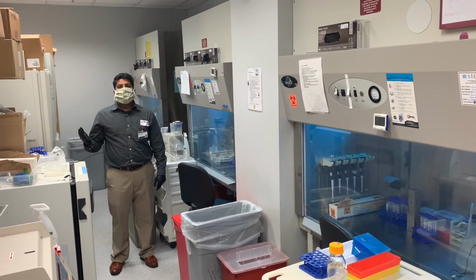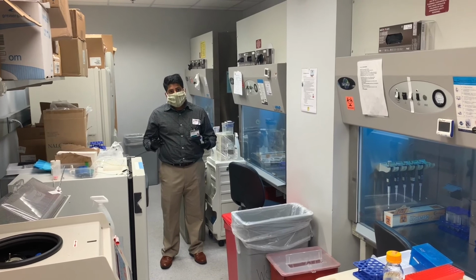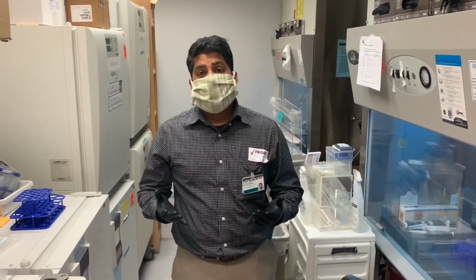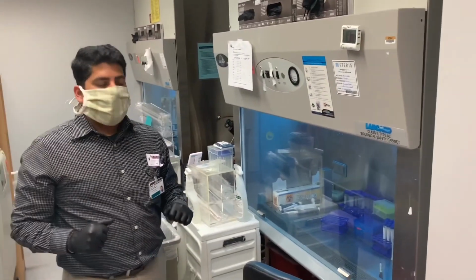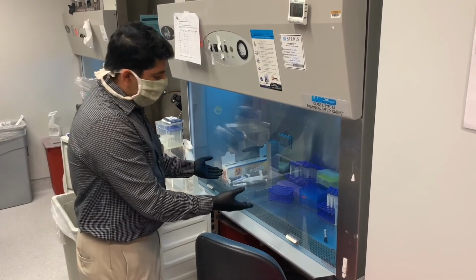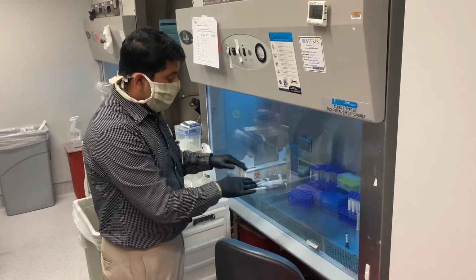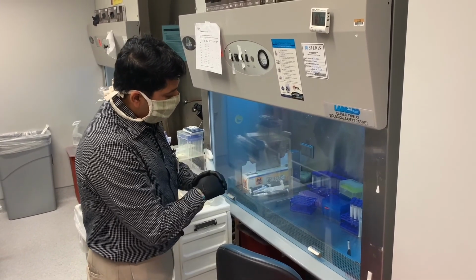Well, welcome to our tissue culture room. This is the room where we work with growing and maintaining and studying live cells. The way that we do that is that we have to maintain sterile conditions when we work with these cells, and we do so in one of these devices that we call a laminar hood. So in this device, whenever we're working with cells, we work with them with our hands underneath the glass and airflow to prevent any sort of contamination from coming within the hood. The cells are all worked with inside on the metal surface, as you can see.